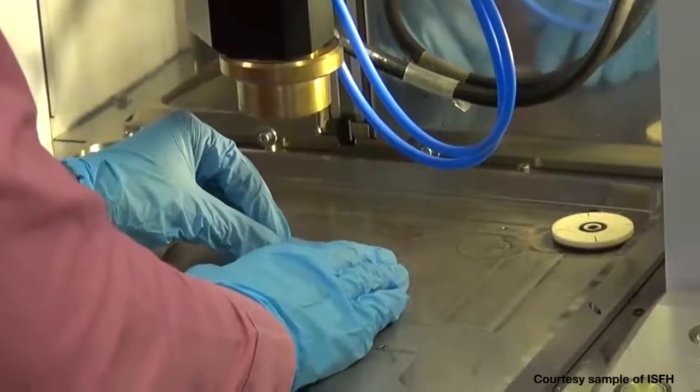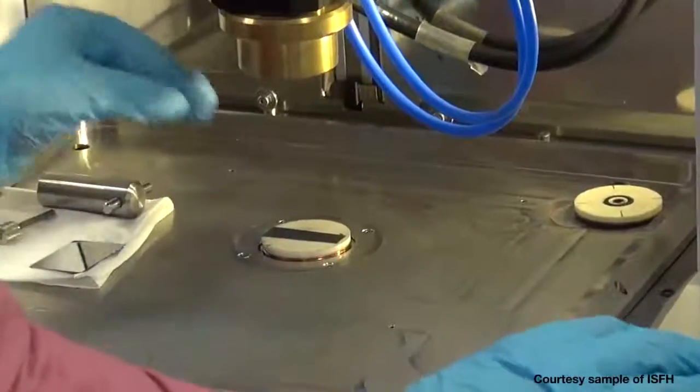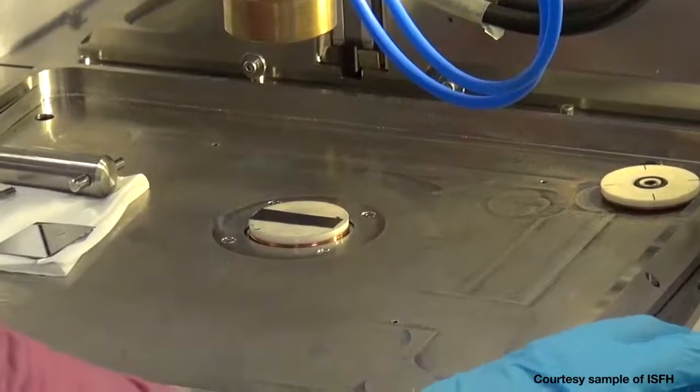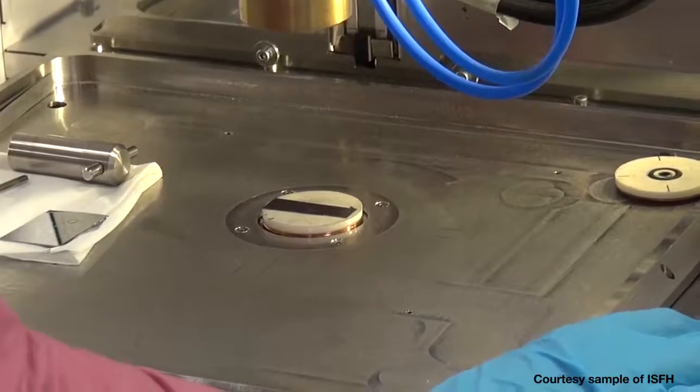One button press and primary vacuum is made, holding the sample in place. A second button press lowers the applicator on the back of the sample.